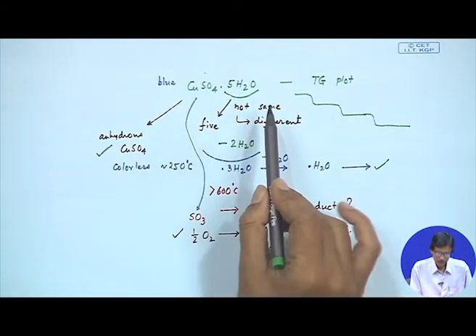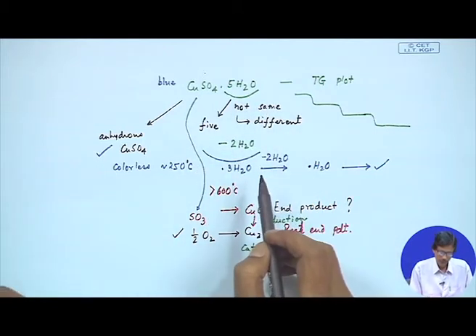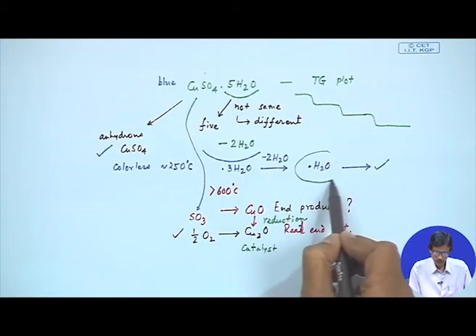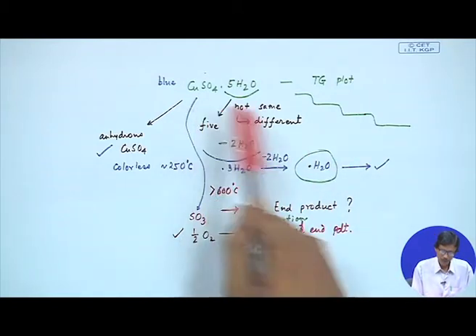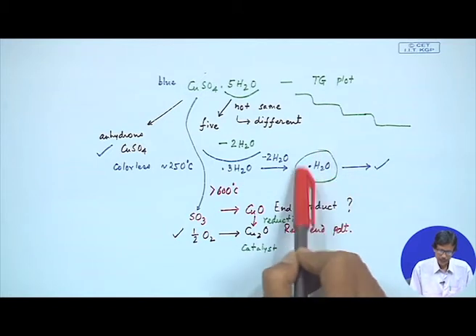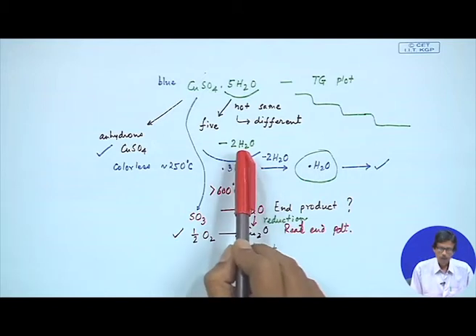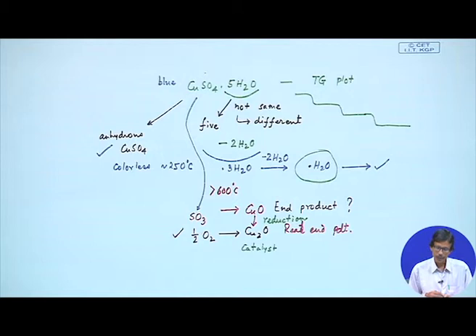So, from copper sulphate pentahydrate we know all the different steps, and we can also get some good idea how the monohydrate has some stability, and this monohydrate can be prepared also. This water binding is completely different, with the involvement of the sulphate. So, that is why this water molecule is completely different from that of the 4 other water molecules which are present and which go away earlier.